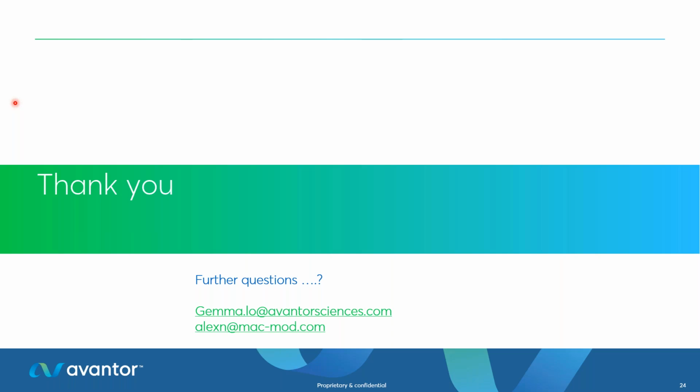Is it just the column chemistry that's important for selectivity? No, there's lots of other factors. I think the first webinar we did touched on things like the mobile phase, your organic modifiers, your pH, all of those factors. And if you're running gradients, then all of the column dimensions come into play as well. So there's lots of factors that affect selectivity. The column chemistry is one of the biggest ones, or is the biggest one.